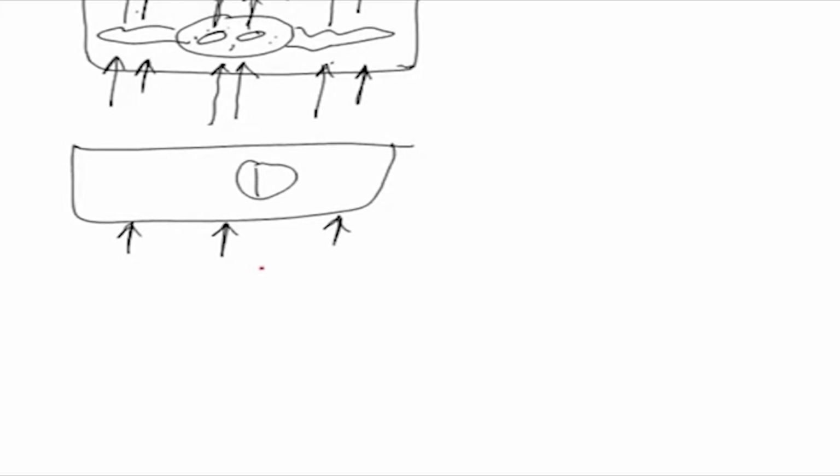First it was 45 degree polarization when they came out of the polarizer. Then as they move through the condenser and specimen, they are still sheared, spatially displaced, not combining and not allowed to interfere, and the shear distance is around 0.2 micrometer or less.